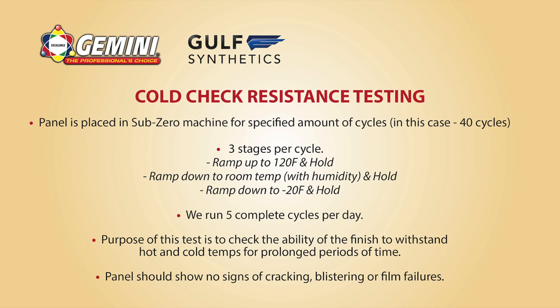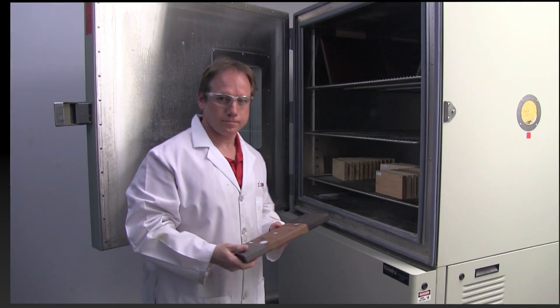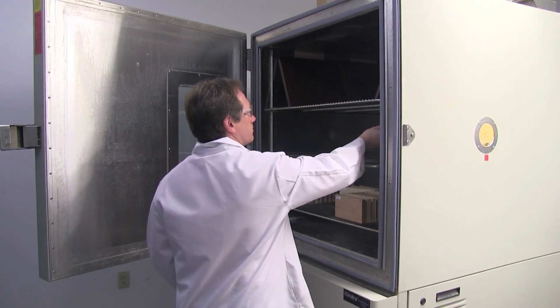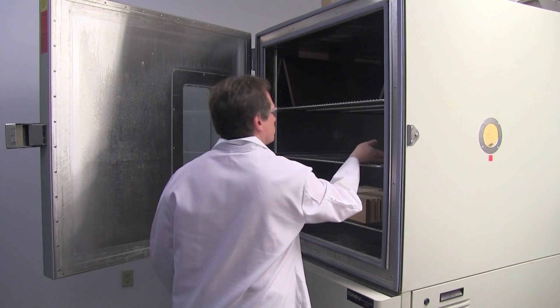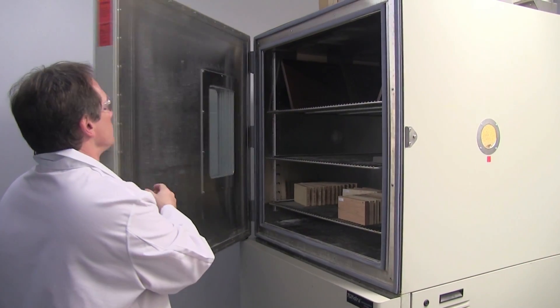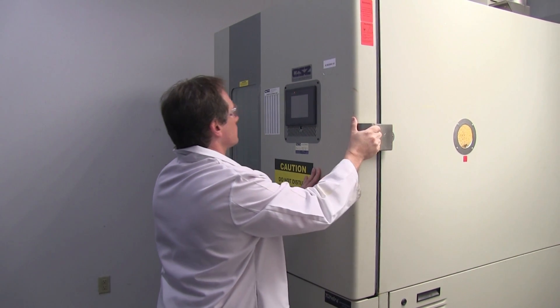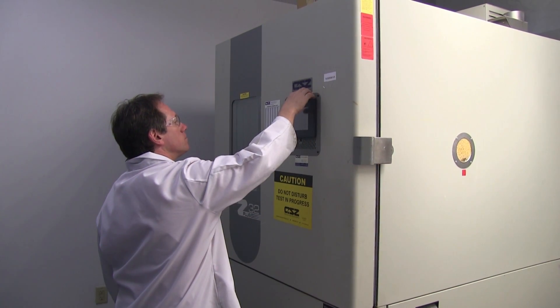The first test that we're going to run on the panel is called cold check resistance. Basically, this is a three-stage test that we use at three different temperatures. What we're going to do is run all three stages five times, so we'll have five complete cycles of those three stages.